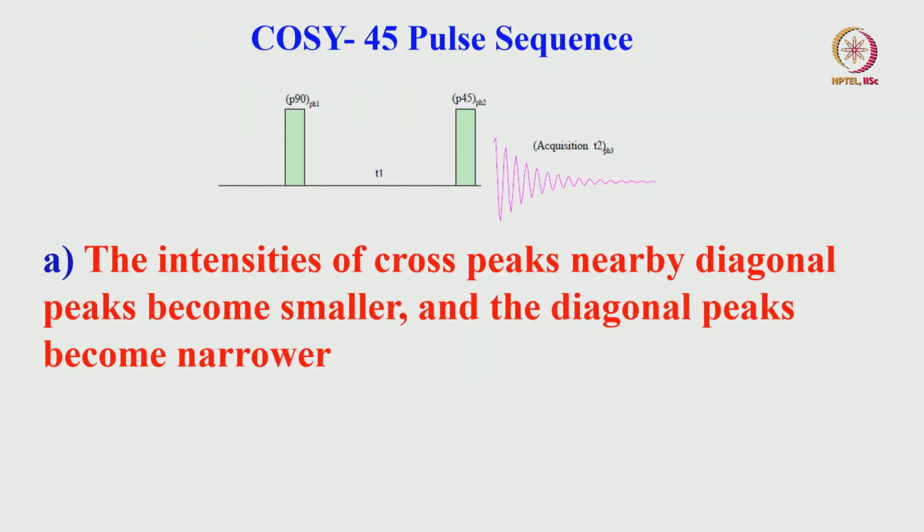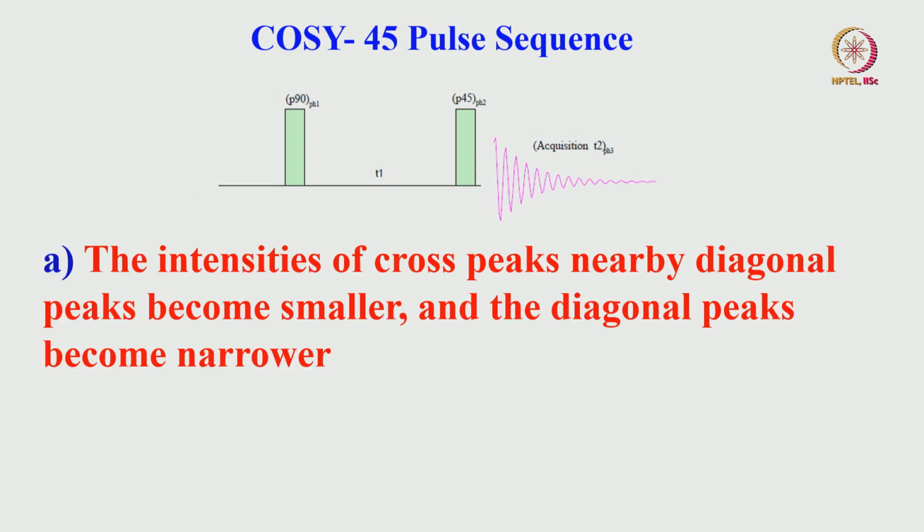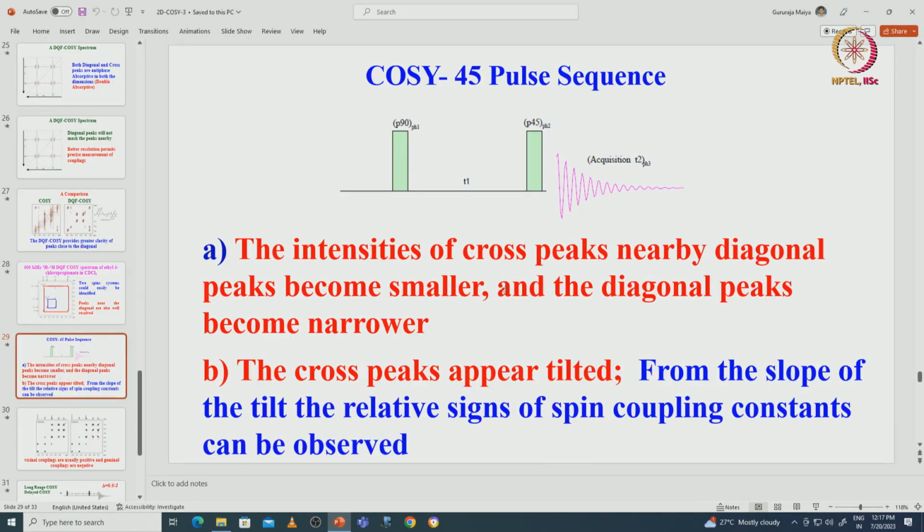And other variants of the COSY are there: COSY 45, COSY 90 and delayed COSY. I will finish this one so that tomorrow I can start with another.